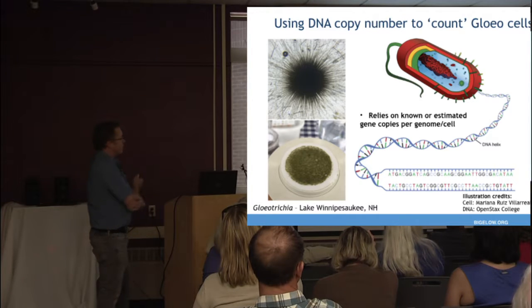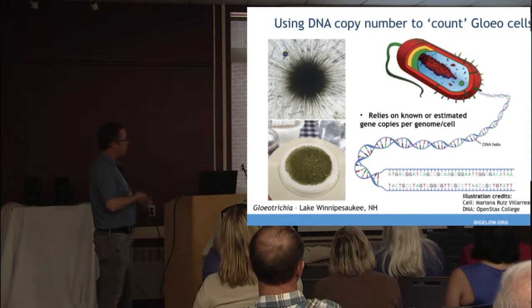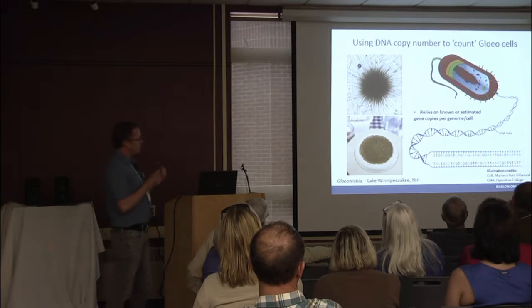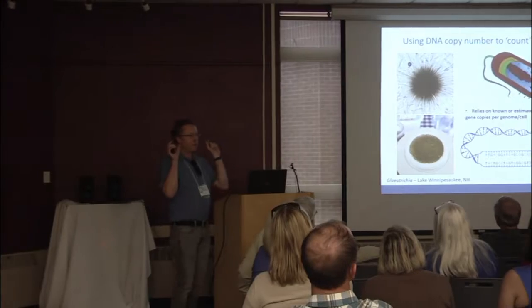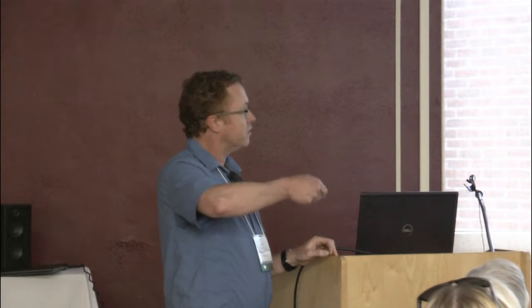So the method that we developed, again with Whitney and Denise and some of their students, was based on extracting the DNA from these cells, so cracking all of these cells open, releasing all of that genomic material into a solution, and then developing specific DNA probes that could go in and find exact matches to that target species amongst thousands of other different types of DNA, and also all the other DNA that came out of the target cell.